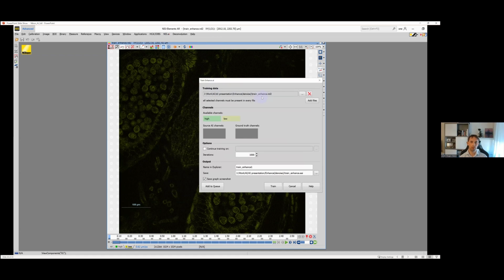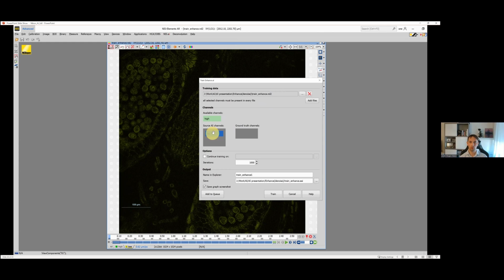And we specify our low signal as a source AI channel or input, and our ground truth as an output high quality channel. And we choose the name of the file which will be the result of the network. So we press train.